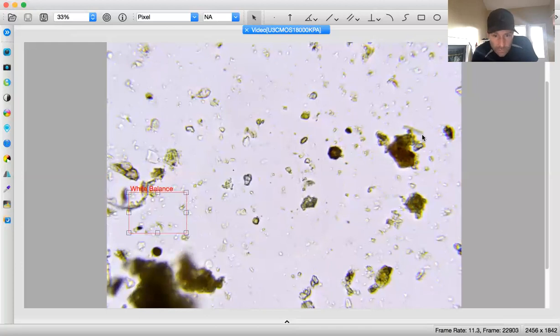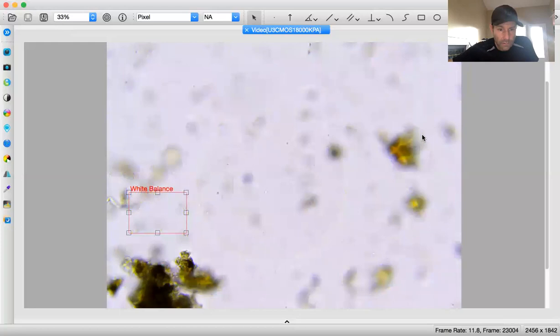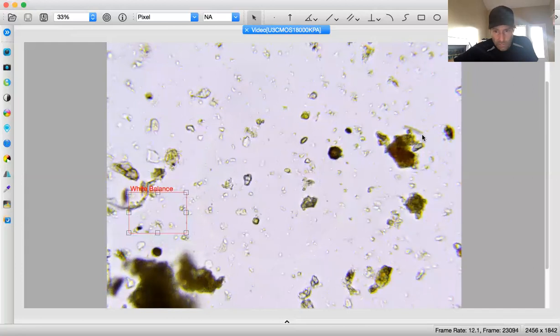No flagellates zooming out of anywhere at the moment. It's nice to see some flagellates, though. I tell you, man, I'm liking the compost the guy's giving me. The microscope assessment I did gave this compost a 0.8, so it will be very, very interesting to see where we're at here now that it is at my property. Before, because I did the assessment, the first one, before I got it here.